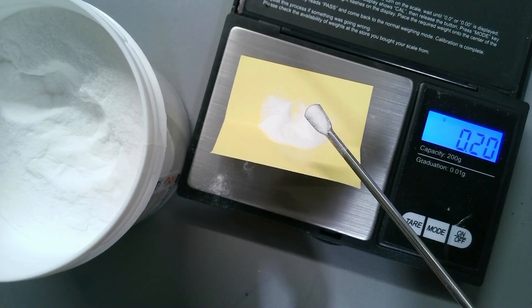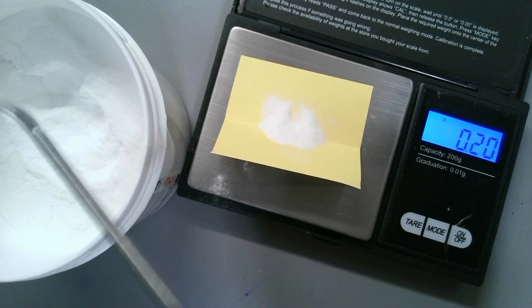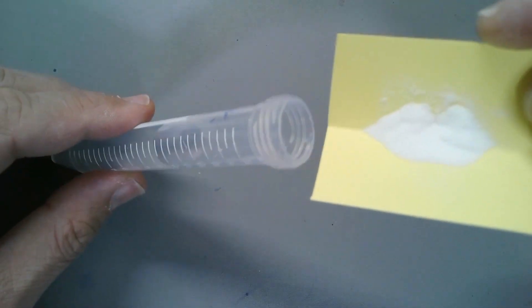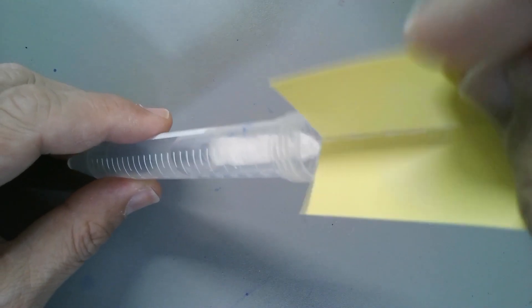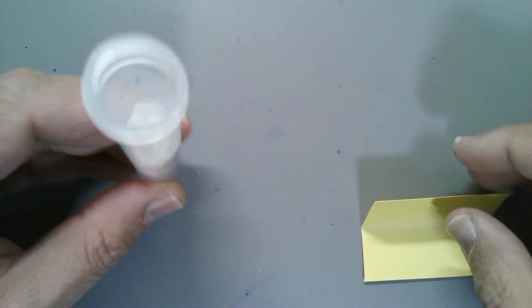If you want to make methyl cellulose yourself, I recommend that you take 0.2 grams of methyl cellulose and add approximately 10 milliliters, 10 grams of water. You resuspend this properly, wait maybe for a day or so for the methyl cellulose to completely dissolve. And then you get a very clear and very viscous solution.